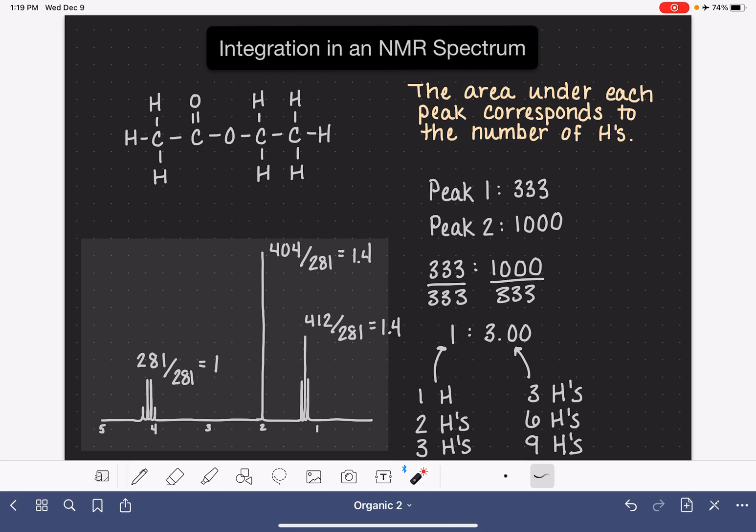What do we do with these 1.4 numbers? If the numbers are pretty close to 1, like if this was 1.1, I'd probably feel comfortable rounding it to 1. But since this number is close to 1.5, it's not really close to 1 and it's not really close to 2, I don't feel very comfortable rounding these numbers. So what I'm going to do in my next step is multiply all of these numbers by 2. If I'm doing the same thing mathematically to all of these numbers, I'm not disrupting the ratio. I am maintaining the ratio, just messing with the numbers mathematically to get them to work out to something more reasonable.